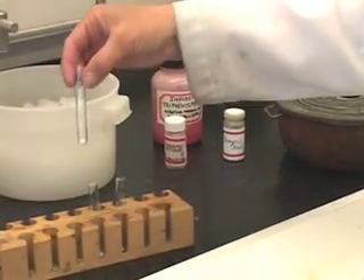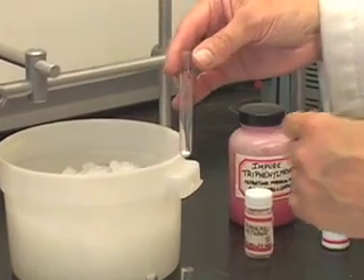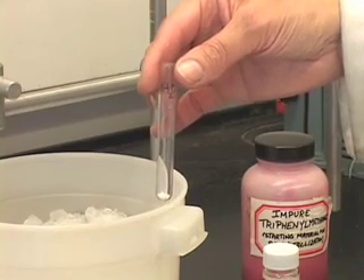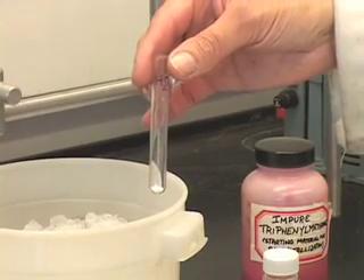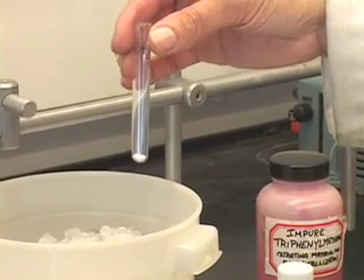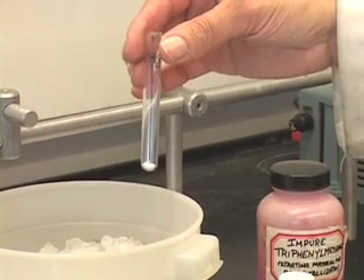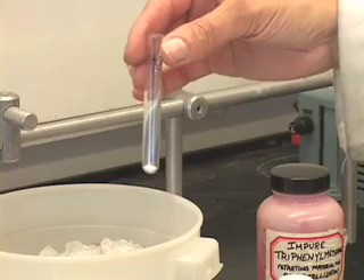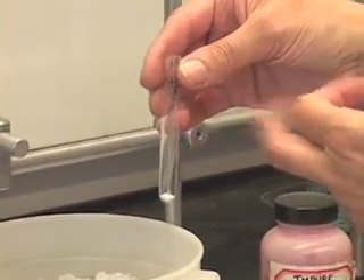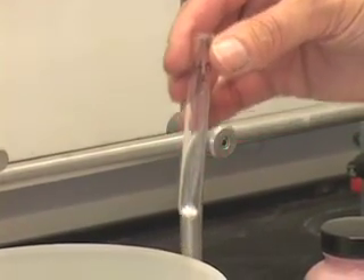First, take the test tube labelled as water — you have the solid in it — and add about a milliliter of water. How much is about a milliliter? The volume of this test tube is about 3 to 3.5 milliliters, so you do not need to measure exactly 1 milliliter. If you fill the test tube up to about a third, then you have about a milliliter of solvent.